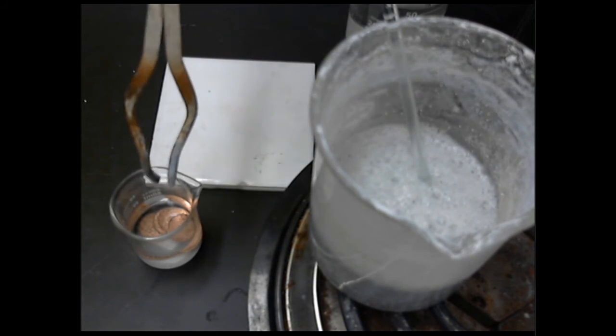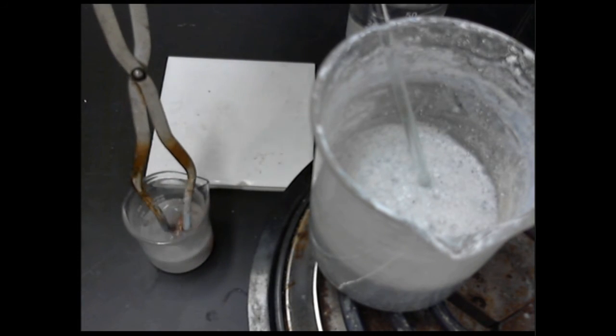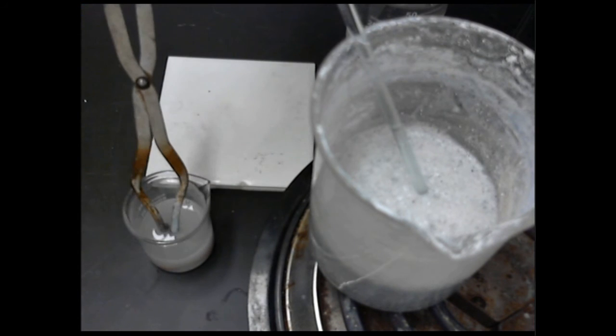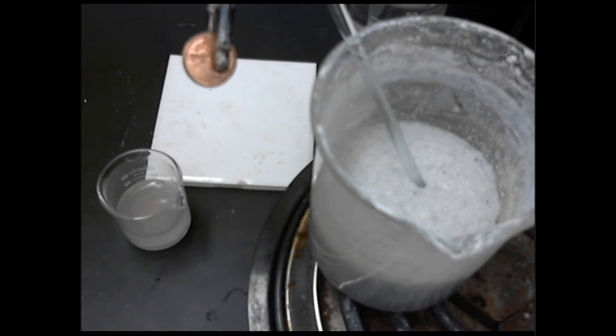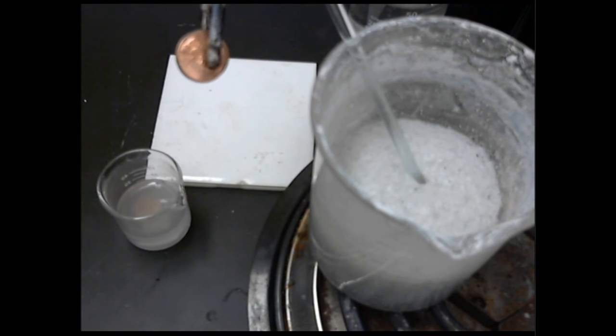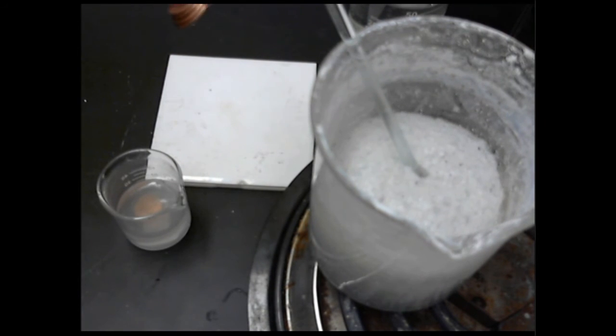And over here I have my pennies, which I've been soaking in a solution of salt and vinegar to try to remove any dirt or crud from the outside of them. You're supposed to use pennies that are shiny, but made before 1983, which is very, very difficult to find. So I find that shiny, newer pennies do the job just as well with the copper content that they have. They are made of some copper, but they're made up of a lot more zinc than they used to be.